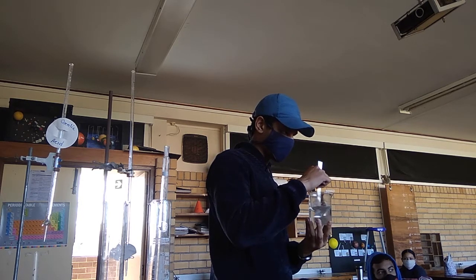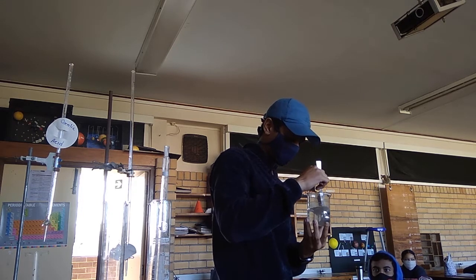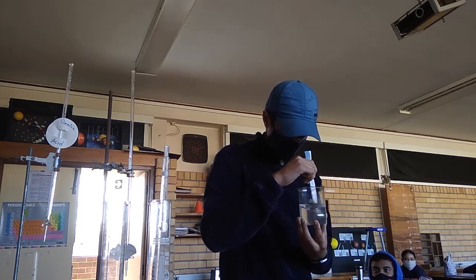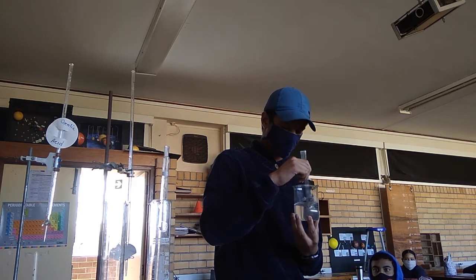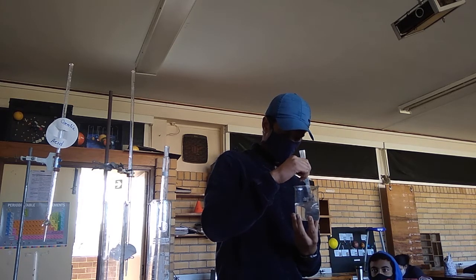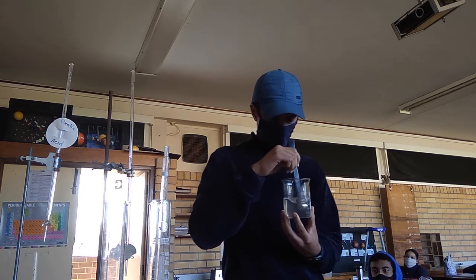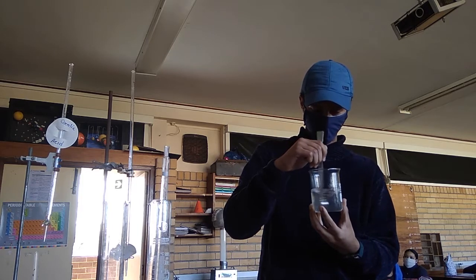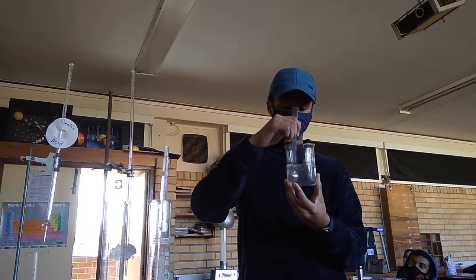Now you can see it's taking a while to dissolve. So sodium hydroxide, would you call it very soluble, slightly soluble, or insoluble? It's not super soluble, right? It's soluble, so it is in the middle of solubility. So there's one solid little chunk that's disappeared, hasn't it? Okay, fantastic. So Kyle's got his marks.